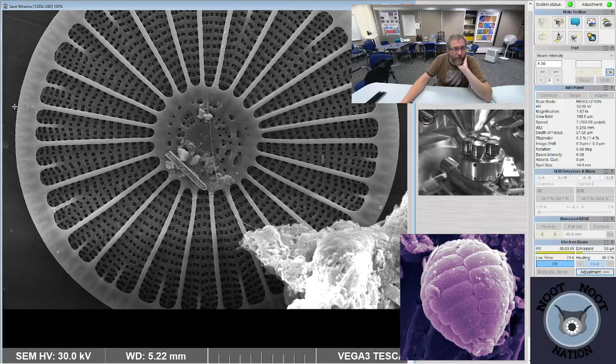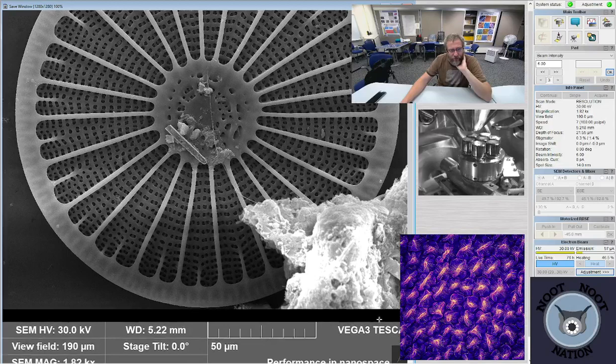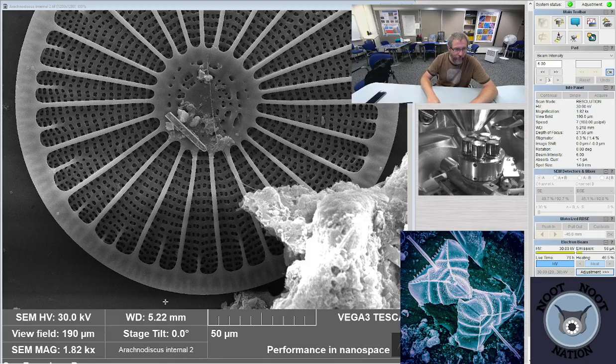So it's nice. You see this sort of shadow right here, and then this sort of area of the image that's really bright. It's because that's facing the sensor, as if a flashlight was reflecting off of a surface, and there's actually a shadow behind it that's created the same way, like you would if you were looking at it with a flashlight.